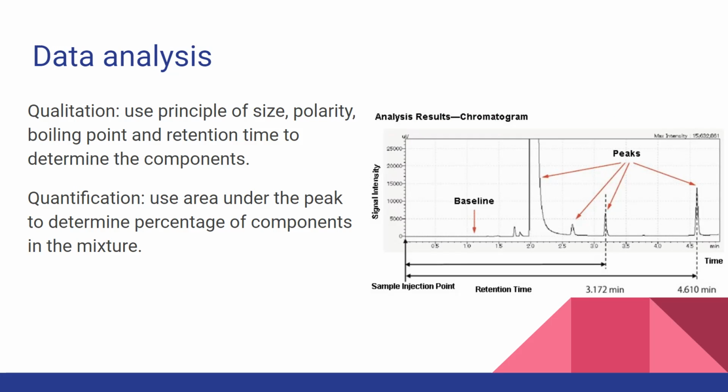Data analysis can be qualitative and quantitative. We can use the principles of size, polarity, boiling point, and retention time to determine the components. We can use the area under the peaks to determine the percentage of components in a mixture.